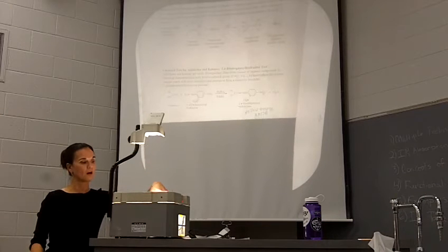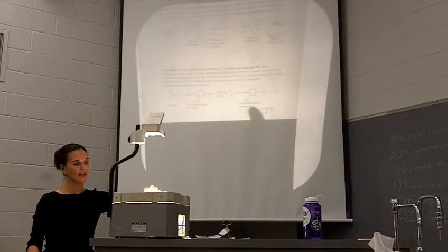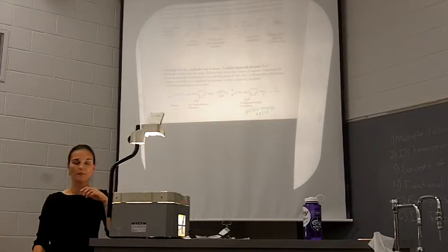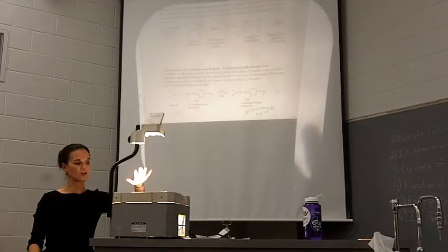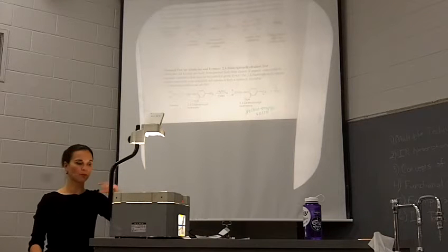Wear gloves as well. When the ketone reacts with the 2,4-dinitrophenylhydrazine, you form what is called the hydrazone. So this part here is our hydrazone, and it gives a yellow-orange solid, okay? And sometimes you have to heat them. Sometimes they don't turn color right away. But depending on the ketone, it should be either yellowish or yellow-orange that you see if you've got a positive result. And there's only one chemical test for that, okay?